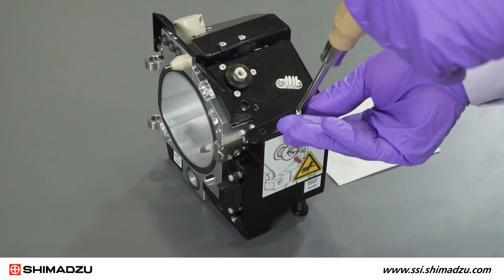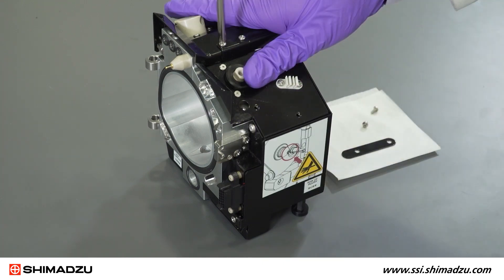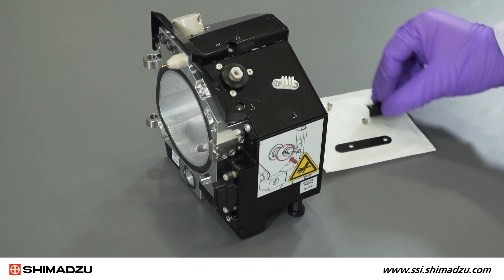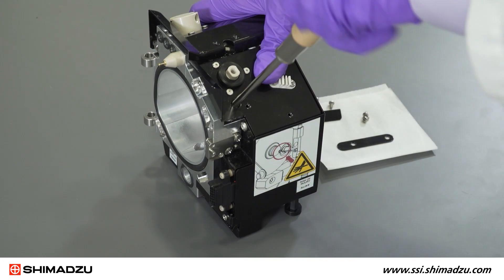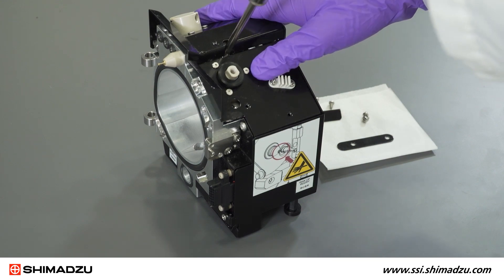Loosen and remove the two screws fastening each cover, then remove the covers. Loosen the locking screws securing the spray unit, but do not completely remove them from the interface.